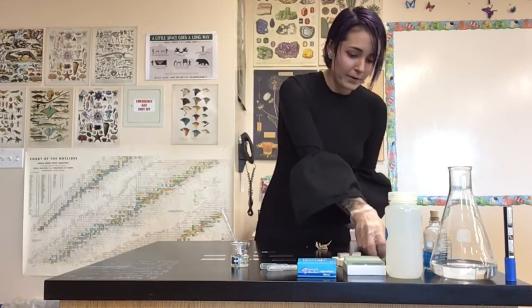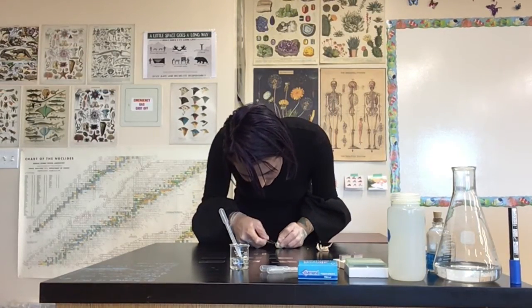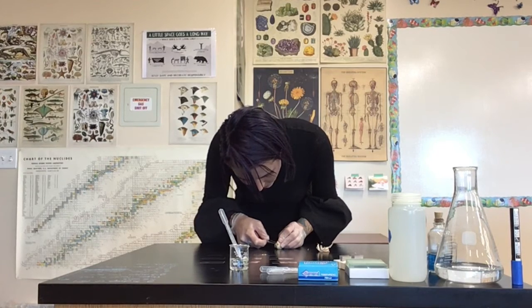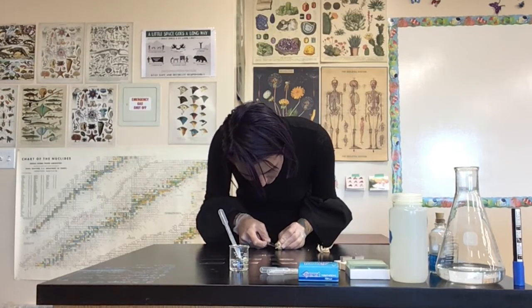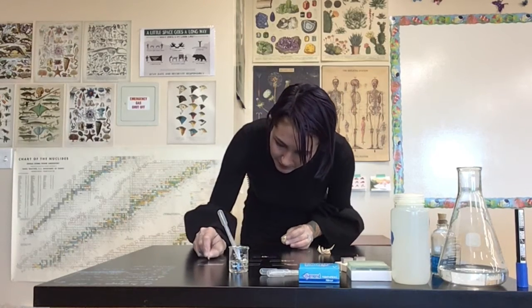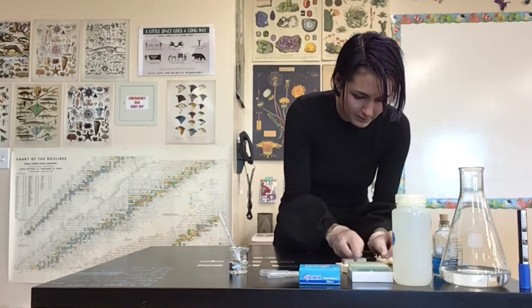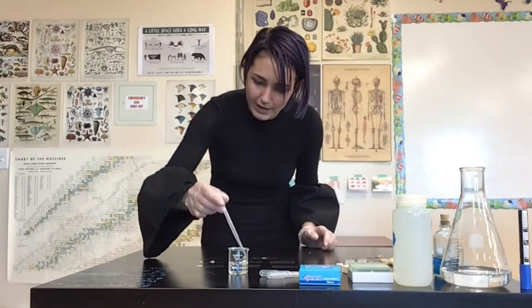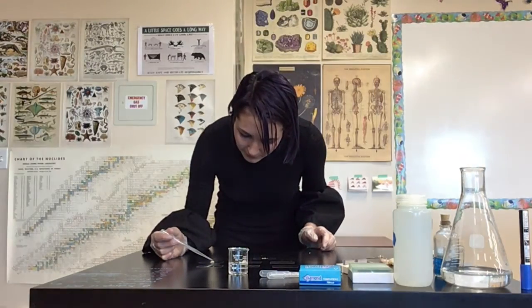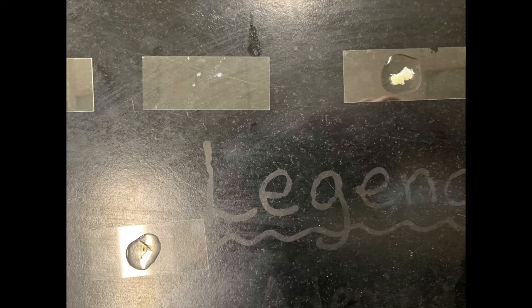So I'm going to use my tweezers here, my forceps if you want to be more scientific, and try and just cut off a small amount. And I'm going to put it on another slide and do the same thing. I'll do a few drops of hydrogen chloride and we'll wait for 5 minutes. Let that do its thing too.